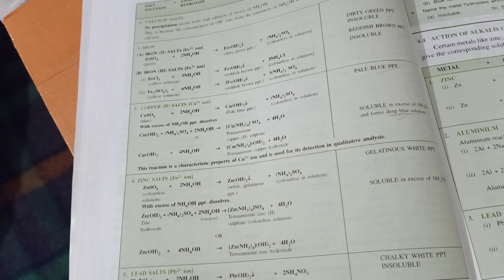So with the help of this analysis, we can find out three things. One, the cation present in the given sample. Number two, the difference between two or three types of salts with the help of reagents. And number three, the differences between sodium hydroxide and ammonium hydroxide.